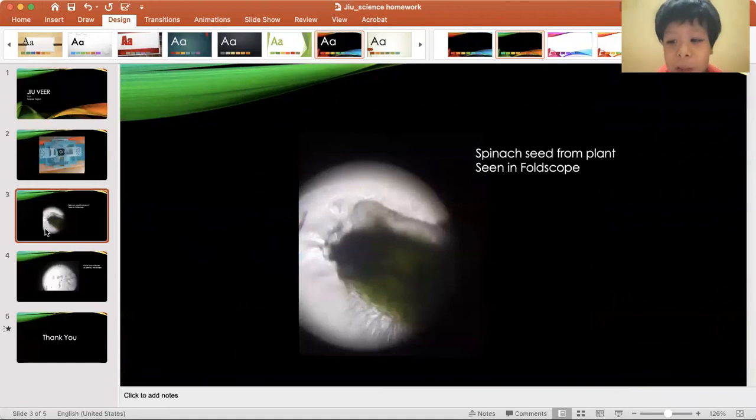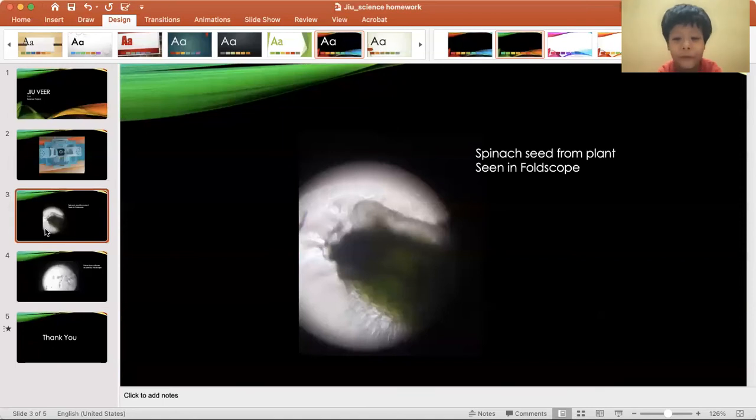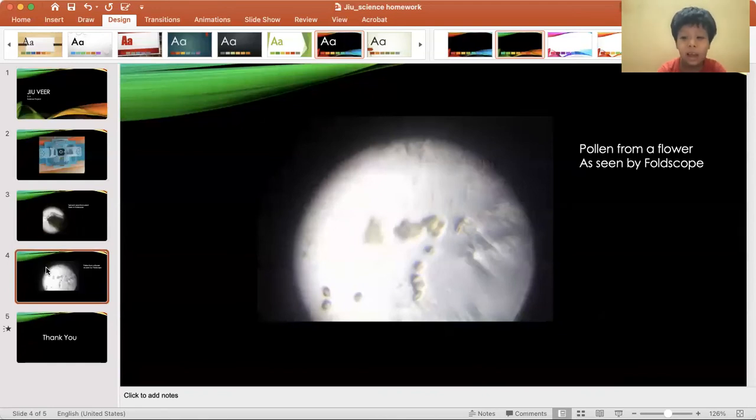Here is a spinach seed from the plant, as seen in the foldoscope. Same thing happened with the pollen — it's seen in the foldoscope and also it's from the plant.